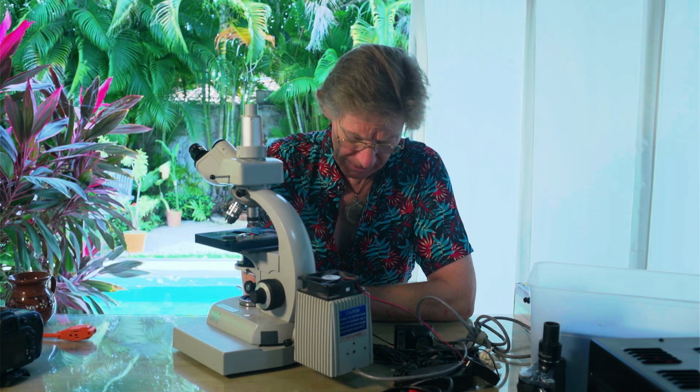There are microscopes available on the internet through various sources that do not have what is necessary to do high-quality live blood work. And they will tell you that they're extremely high quality at a really good price, but you have to be very, very careful what you buy.